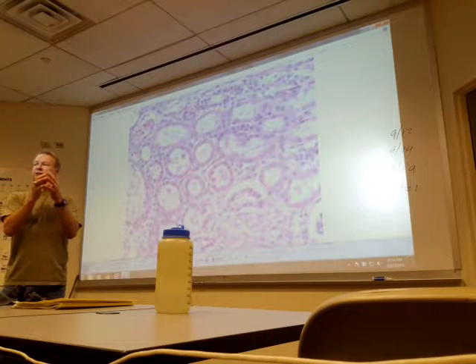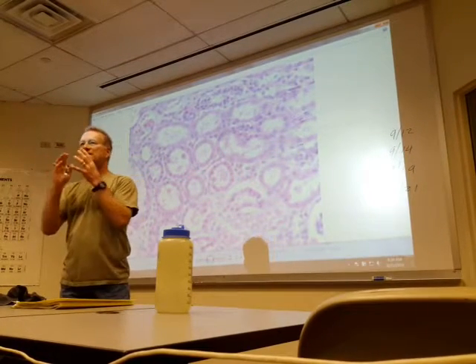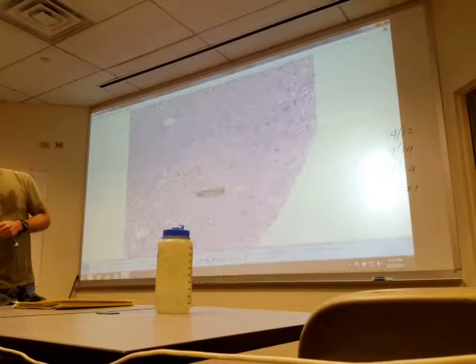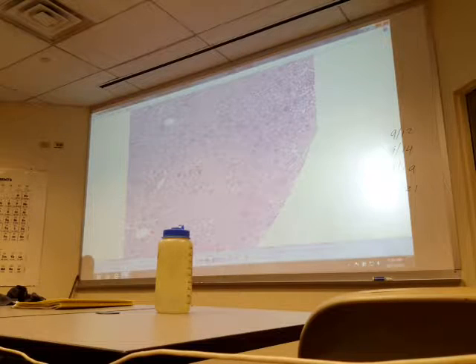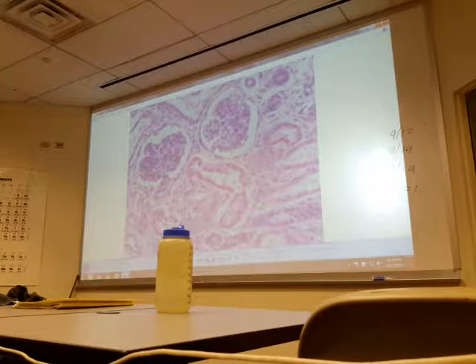Low magnification gives you a large field of view. As you increase the magnification, you get more detail, but a smaller and smaller field of view. So again, your initial identification very often occurs with the lowest magnification. Since I know that, when I test you, I usually start with a low magnification. So you've identified this as kidney. We don't want to start with this. Most of you could tell that was kidney, but it's not a place to start.